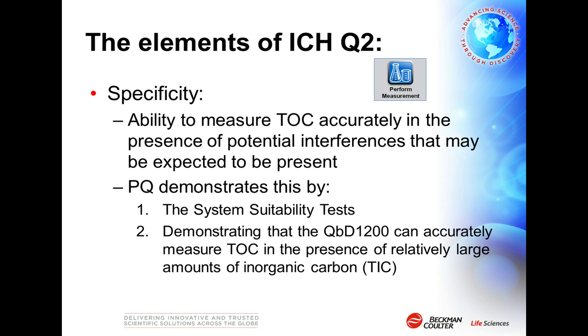Now, the specificity test demonstrates that the TOC analyzer can measure and report TOC accurately in the presence of potentially interfering substances that may be present in the sample. Now, this is demonstrated by carrying out 2 tests. One is a system suitability test to ensure that the TOC analyzer can successfully analyze the full range of organic materials expected to be present in pharmaceutical grade water.